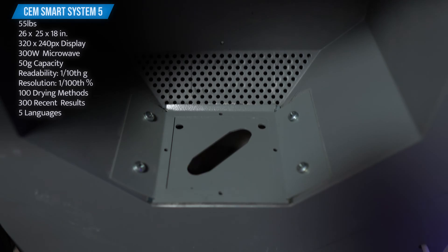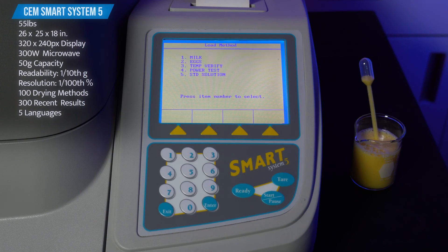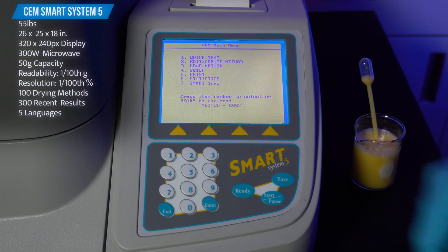The max capacity of the balance is 50 grams and has a readability of 1 tenth of a milligram. Test result accuracy is within 1 one-hundredth of a percentage, and the instrument can read any range of moisture or solid content. You can save up to 100 different drying methods and view 300 recent test results.